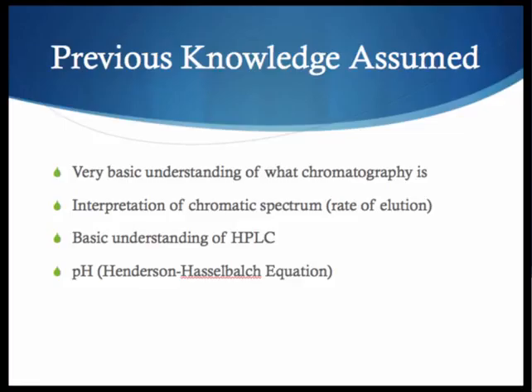And I also expect you to be able to interpret a chromatic spectrum and being able to calculate the rate of elution, and then having just a basic understanding of what the HPLC is, and also knowing what the Henderson-Hasselbalch equation is and the relationship between the weak acid and the conjugate base.